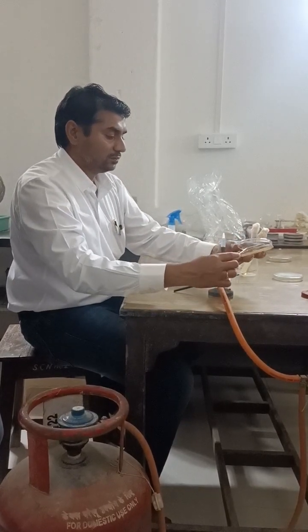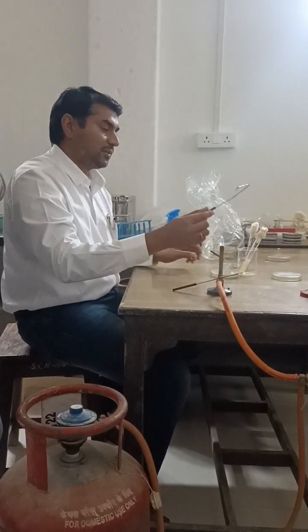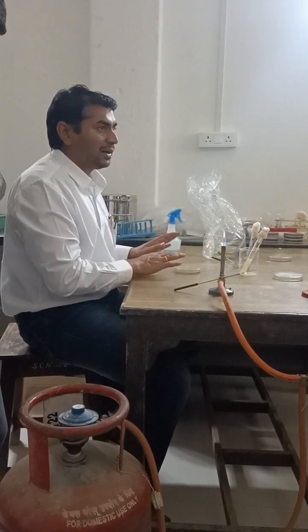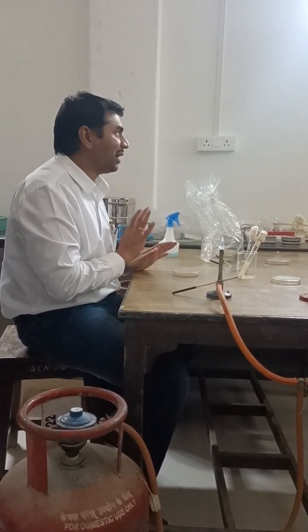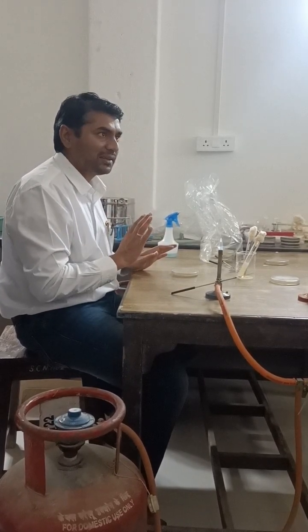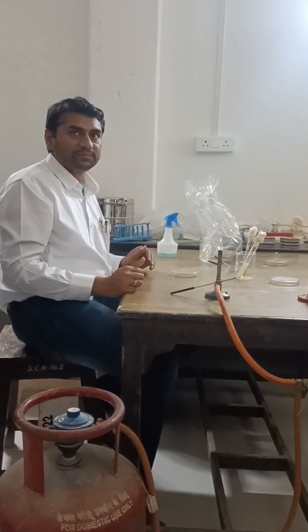Disinfect the spreader again using ethyl alcohol, or simply place it in ethyl alcohol. Set the petri plate aside for soaking of moisture, then incubate the petri plate in the incubator.